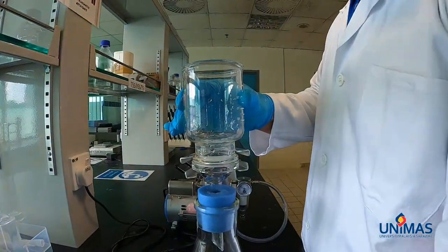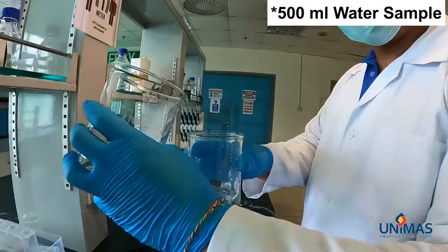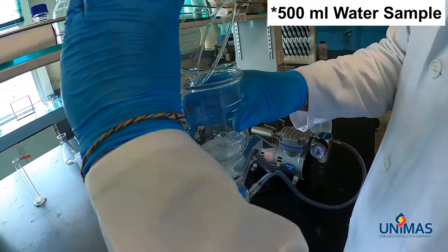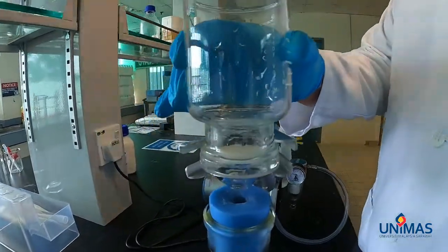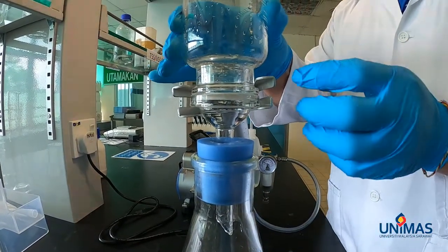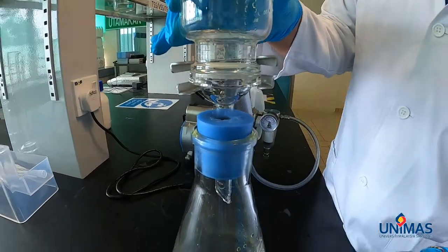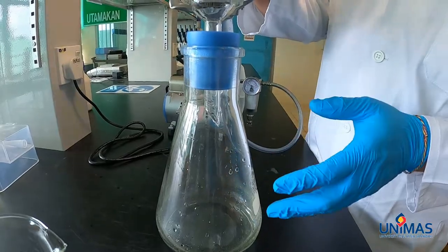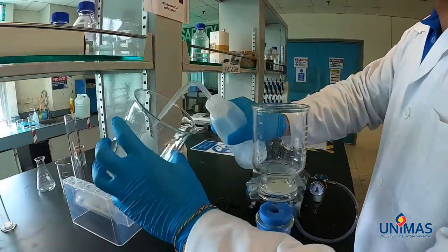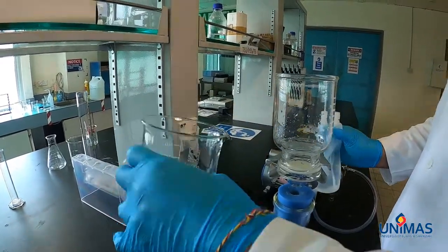Here we have 100 ml of water sample, which we will be pouring in. In theory, whatever is retained in the filter is considered total suspended solids, and whatever can pass through the filter is called total dissolved solids. What you need to do next is to rinse the wall of the beaker to make sure that all the solids in the water sample pass through the filter.